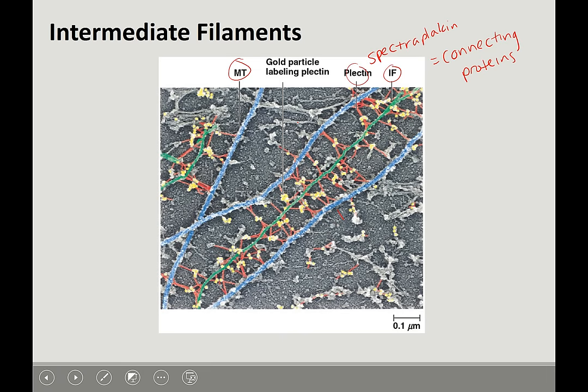And just so you know, this is a scanning electron microscope image that's been false colored. Okay, so you can see that basically they took a magic marker, however they do it, computerized, and colored all of these different components. So this is not immunofluorescence, right? Immunofluorescence is always going to have that black background. I'll show you some images. You don't get this 3D appearance. So this is an example of false coloring.